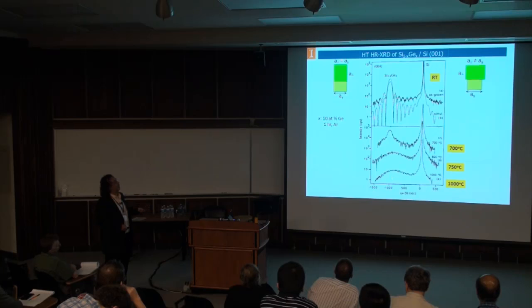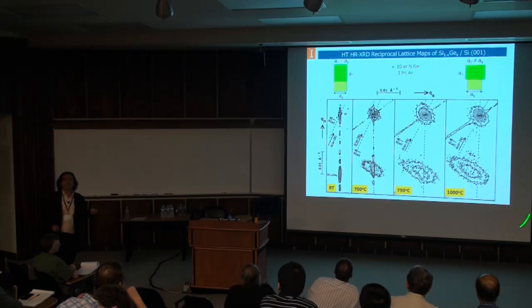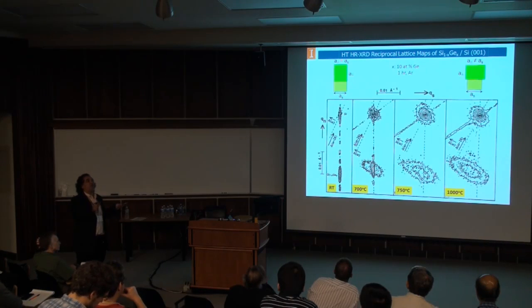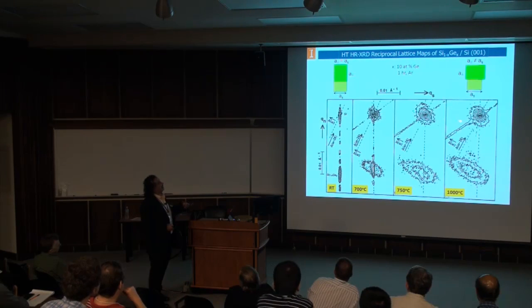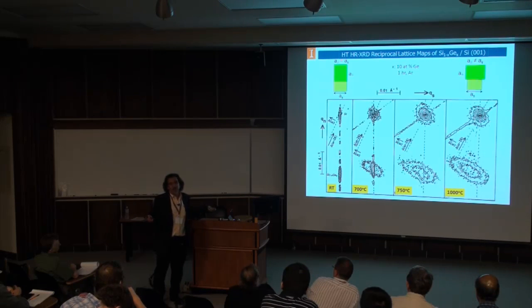Let's look at this in 2 dimensions. Introduce your reciprocal space map. These are actually the dots that I pointed out for you there. Remember, we go in some directions, and these are the dots. I'm sorry to report, but they don't look really nice, they look blurry. So this is real life, my friend. Sorry to break the news.